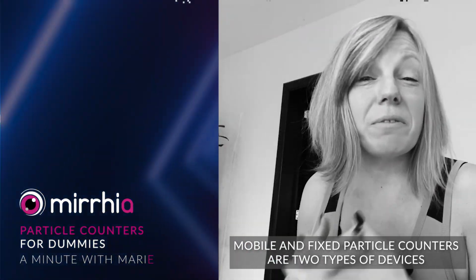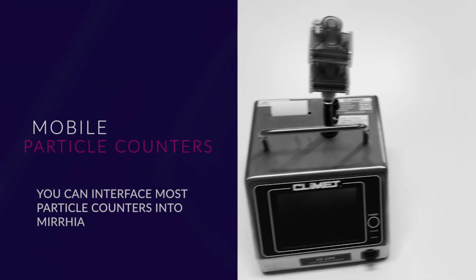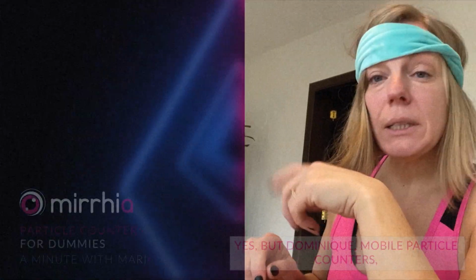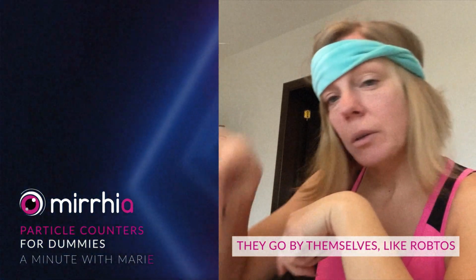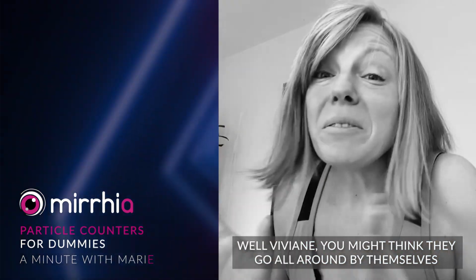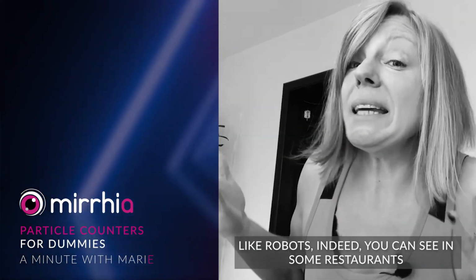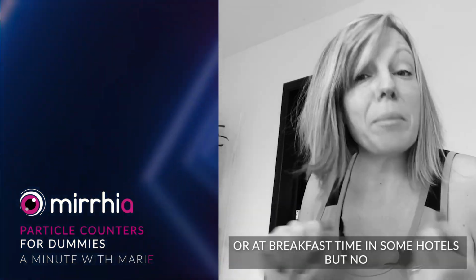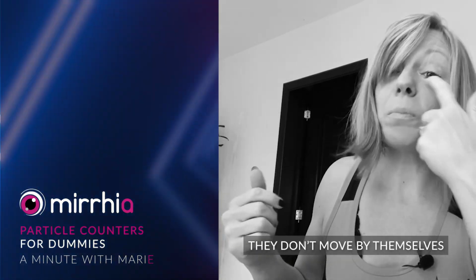Mobile and fixed particle counters are two types of devices used in the pharmaceutical industry. Yes, but Dominique, mobile particle counters, do they go by themselves like robots? Well, Vivane, you might think they go all around by themselves like robots, as you can see in some restaurants or at breakfast time in some hotels, but no, and I don't want to disappoint you. They don't move by themselves.